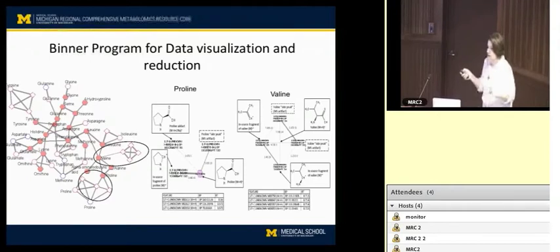So what Alla and her group have done is they're looking instead at correlation networks. In other words, how are all the metabolites that we are detecting related to each other in a network, as opposed to being mapped onto a pathway per se.